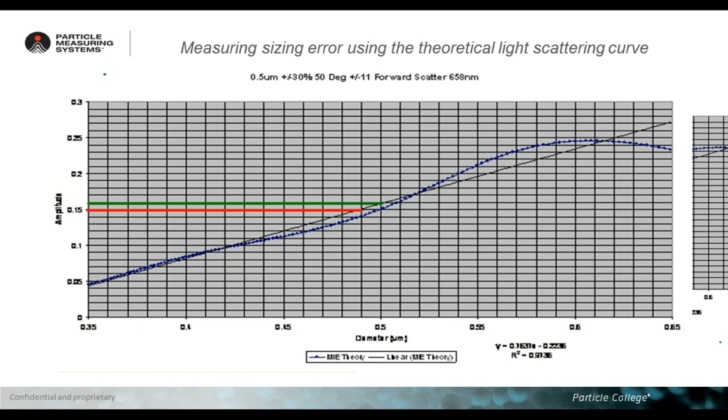The particle size test is performed in conjunction with the Mie curve. This calibration curve is created during the design of the specific particle counter model and allows us to understand quickly the error in size, the error in micron, that the instrument is making.